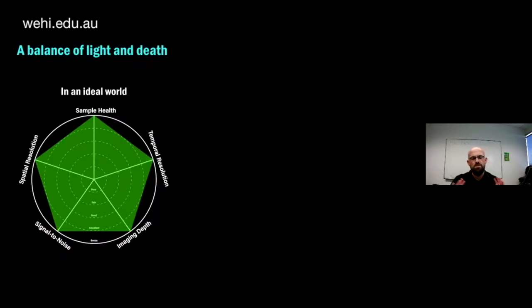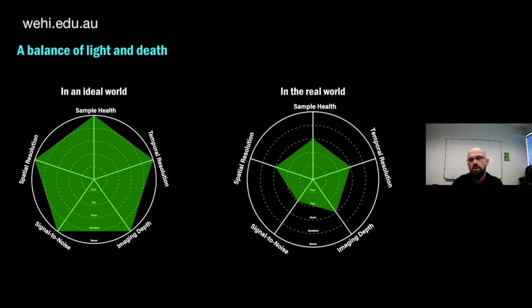But essentially, what the paper was trying to get at was, in microscopy, we always played this trade-off game, where ideally, in the perfect world, we'd have a microscope where we could resolve single molecules in real time, whilst being minimally invasive to the biology, imaging deep into tissues with super high signal to noise. But this isn't the reality of the situation. The reality looks more like this, where you have to pick and choose certain elements of this trade-off. And the surface area of this shape is finite. So when you pull it in one direction, you're pulling it away from other parameters.